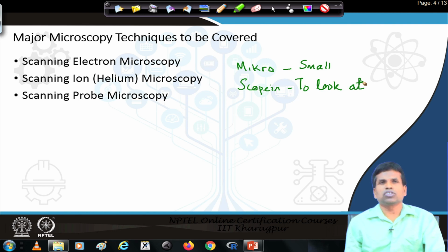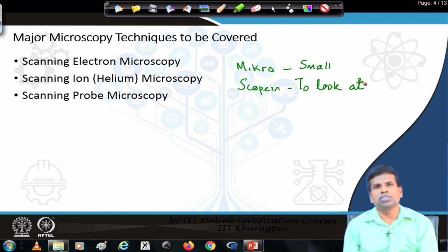Though light microscopy is used extensively in pathological laboratories to see objects which are a little bigger or in the range of the wavelength of the light, we extensively use electron microscope to see objects of much smaller size that we cannot see by the light microscope. So, the middle word is electrons here. If we use electron beam to see an object, then that is called electron microscopy.